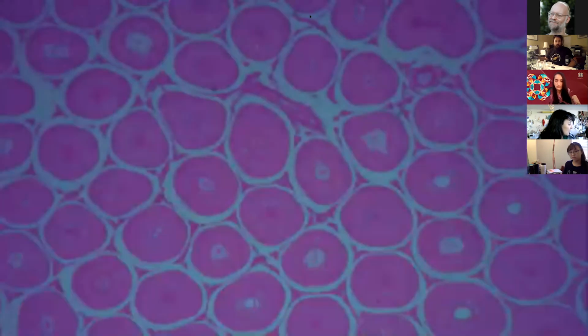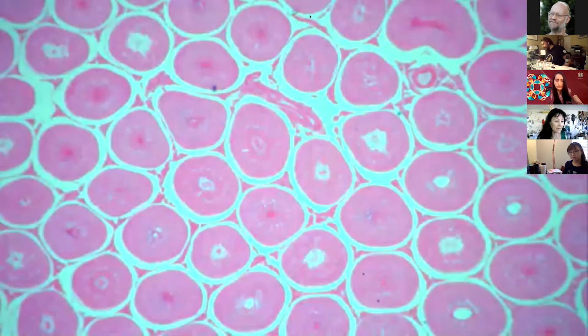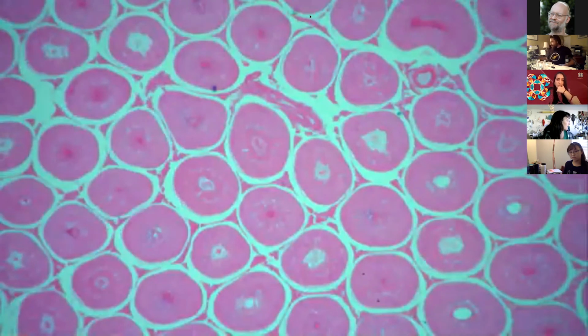And do not be alarmed. I've got a little bit of a test slide on there. So it's, oh, rabbit testicles. I just grabbed it out of a box of prepared slides from Amscope. So that's always fun. All right, cool. So what we're going to do now is we're going to remove that prepared slide. And we have our actual slide we want to look at.